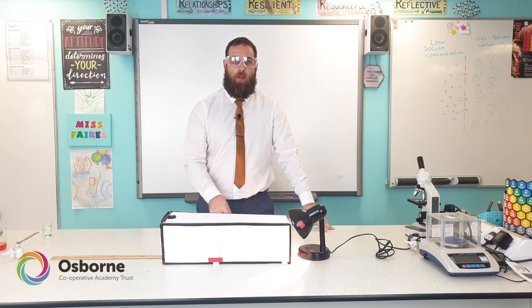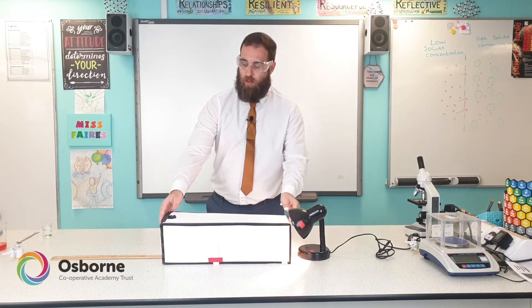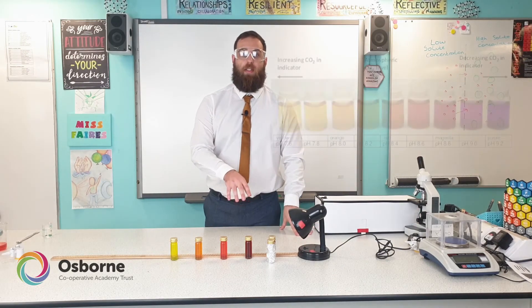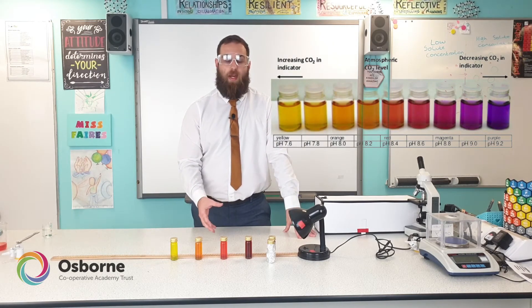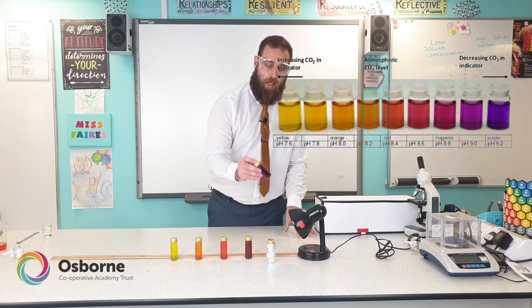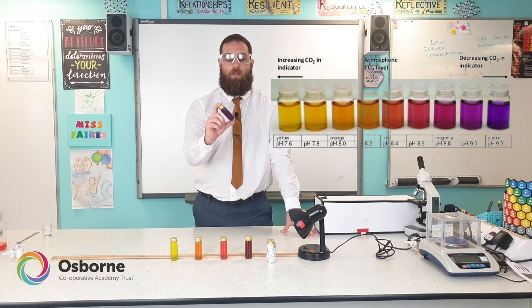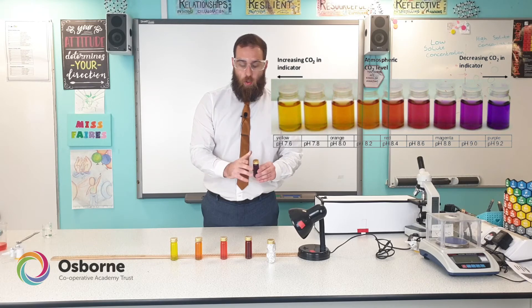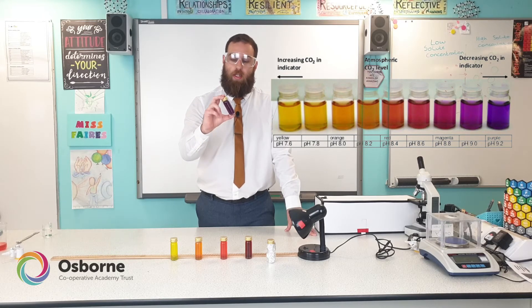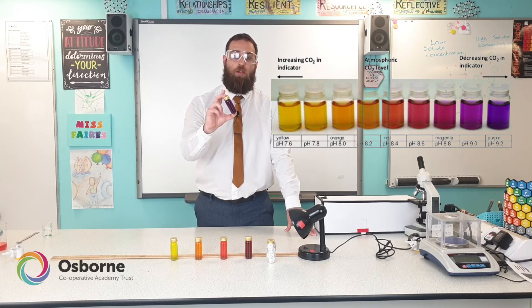We've left it for 60 minutes and we're now going to see what has changed in the Bijou bottles by lifting off the cardboard box. We'll turn the lamp off, and as you can see the colours have changed. Looking closest to the lamp, the Bijou bottle has turned purple — this means there is less carbon dioxide present than at the start. All the algal balls are respiring and releasing CO₂, but the bottle closest to the lamp is using that carbon dioxide in photosynthesis, causing the CO₂ level in the solution to decrease and the colour to turn purple.